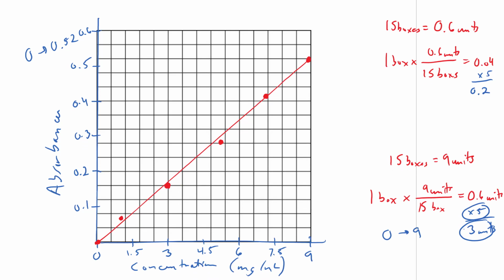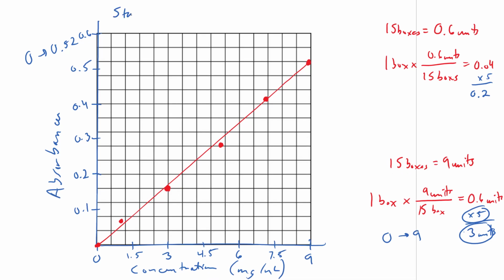Concentration versus absorbance? No, thank you. How about standard curve for BSA at 550 nanometers? A much better title. Please, again, don't use your axes as your title. Concentration versus absorbance? I despise that title. It doesn't bring anything else to the table. A title of standard curve for BSA at 550 nanometers? This is a much better title. It tells me what it is. It's a standard curve. It tells me what the chemical is I'm assessing. It also tells me the wavelength of maximal absorbance.